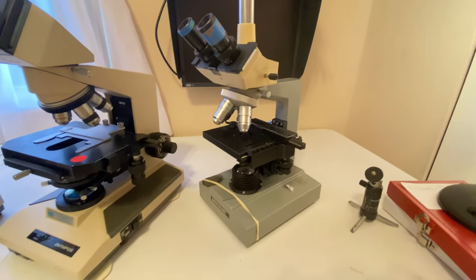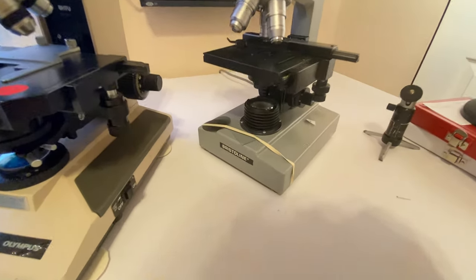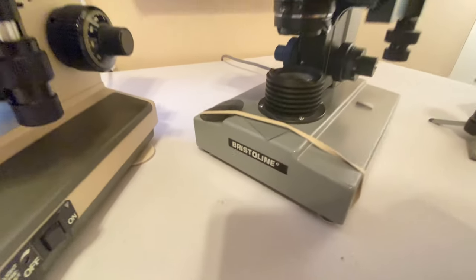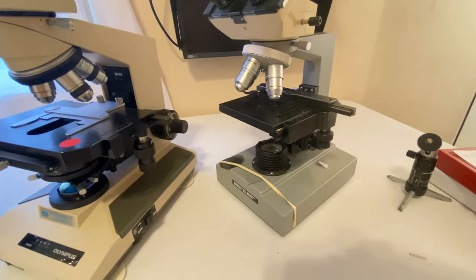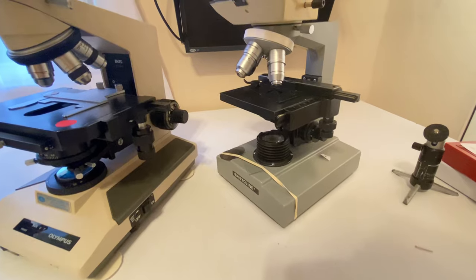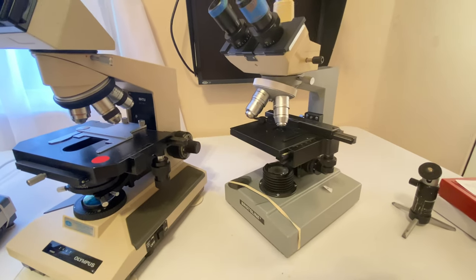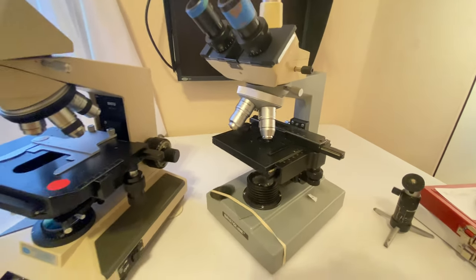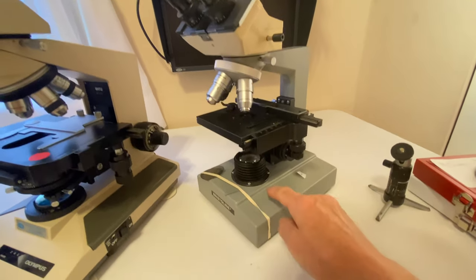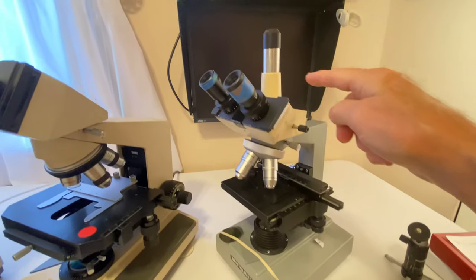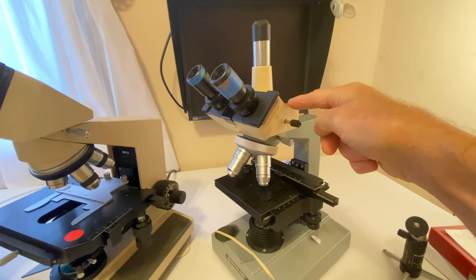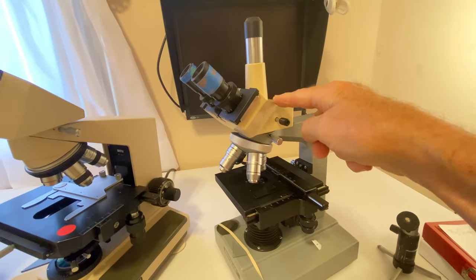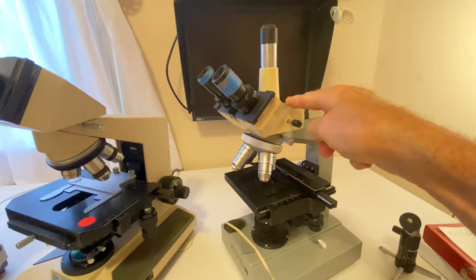This is my first microscope that I got by a company called Bristoline. I believe that Bristoline was an offshoot of Olympus, although I have no proof. But this particular Bristoline, as you notice, has a trinocular head. This trinocular head is actually from an Olympus, and it fits perfectly, as if it were meant to be.